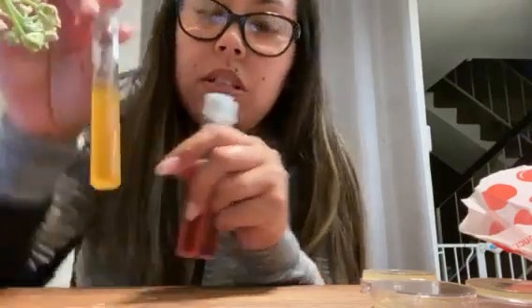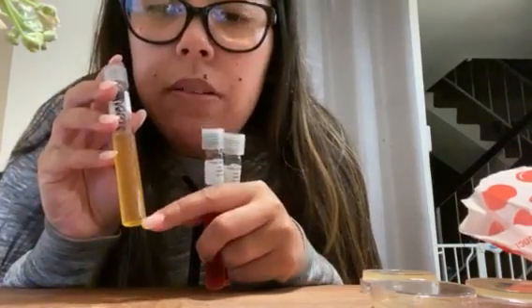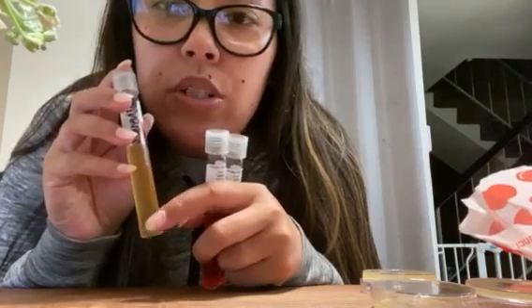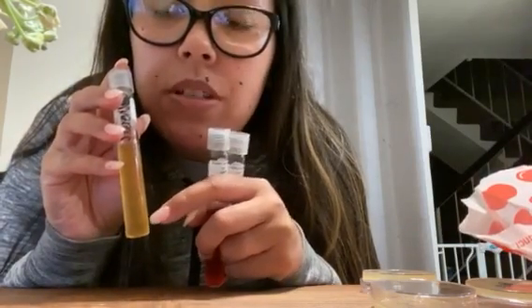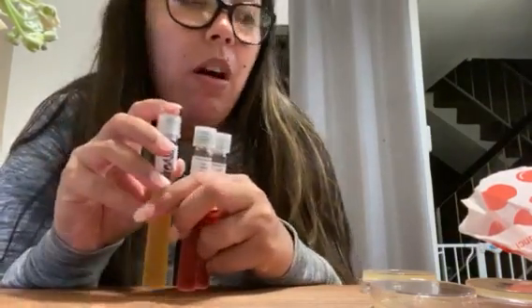I also noticed that when I had incubated it for 48 hours, at the bottom there was a dome-like disc that was just sitting at the bottom, and it still had the cloudiness up at the top.